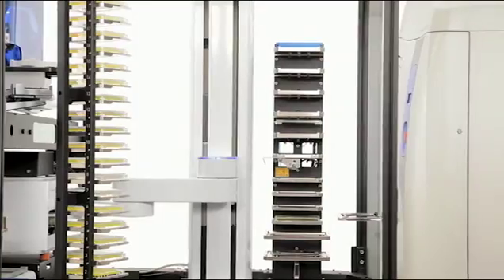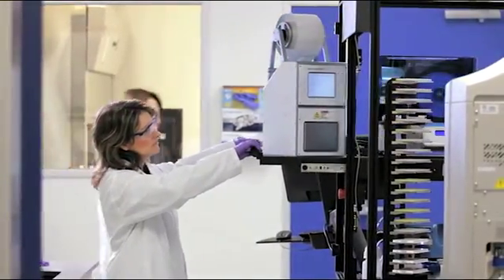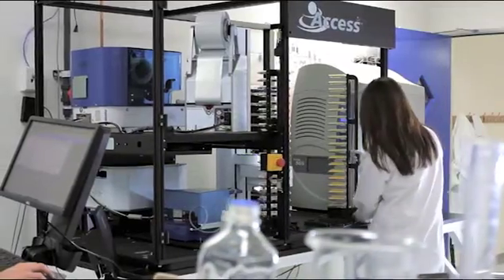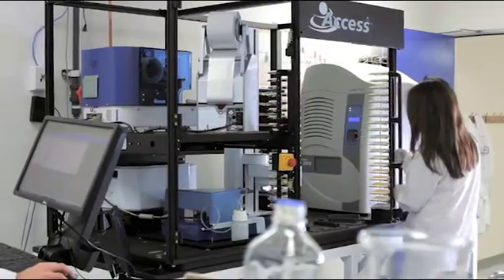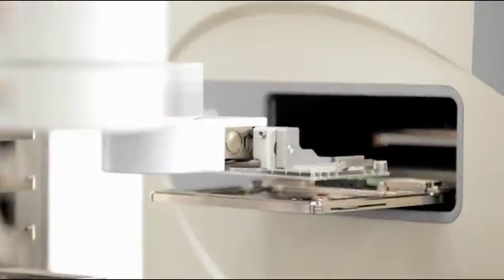The Access workstation is a practical investment for pharmaceutical companies, research institutions, and universities looking to bring the Echo's incredible liquid handling performance to a range of applications. The Access workstation accommodates any Echo liquid handler and directly imports all Echo application protocols.